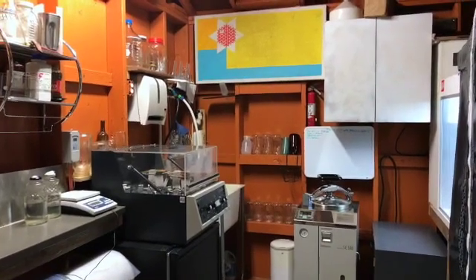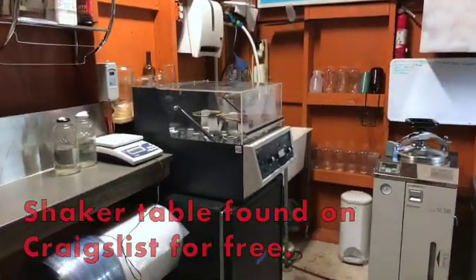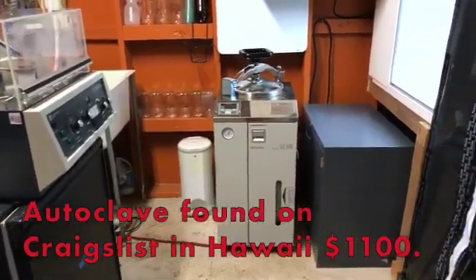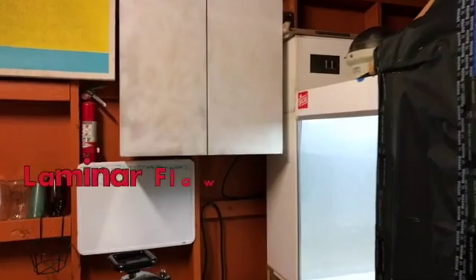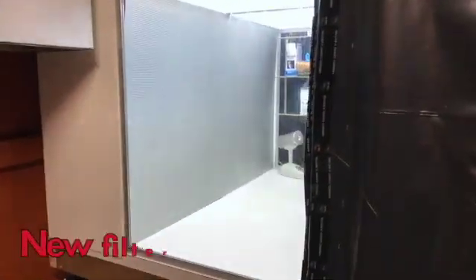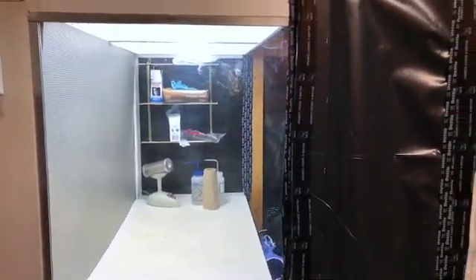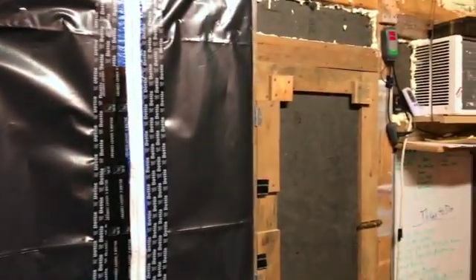Here we are entering the lab. That's our shaker table over there, our autoclave, here's our clean room, laminar flow hood, and over here we have our spawn room.